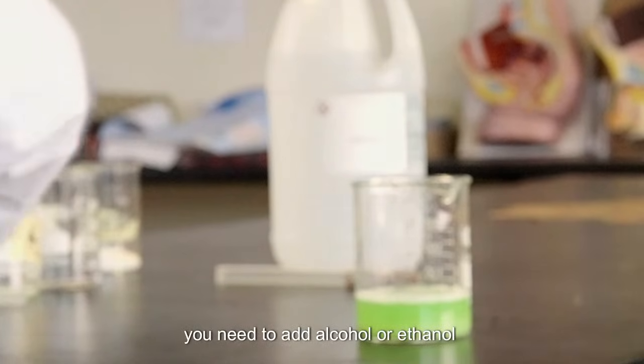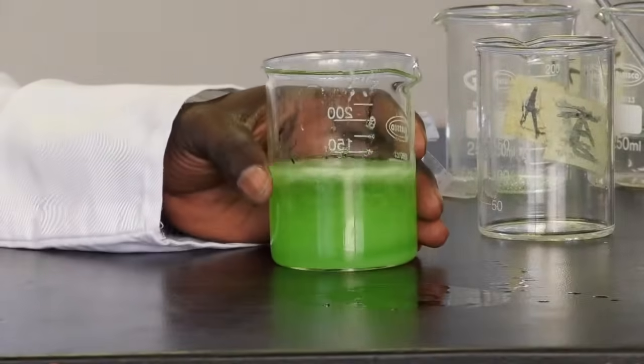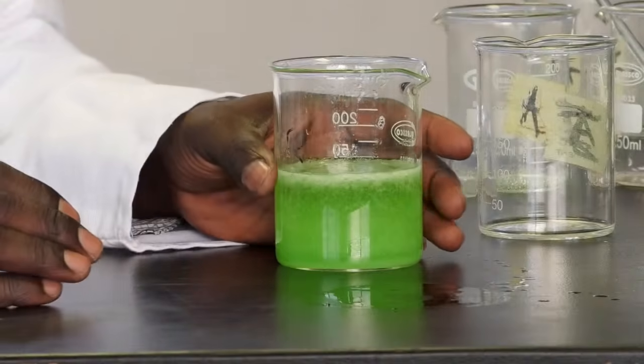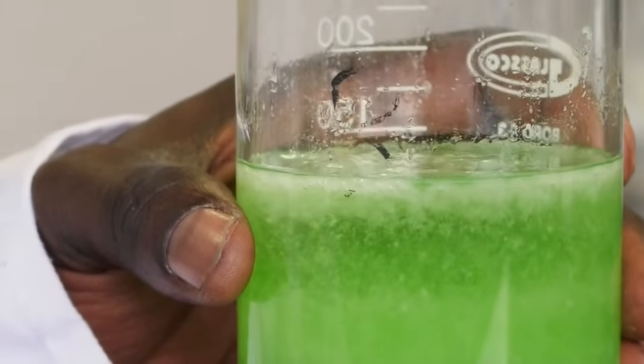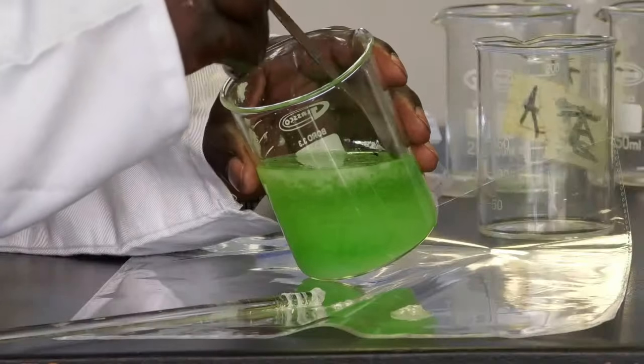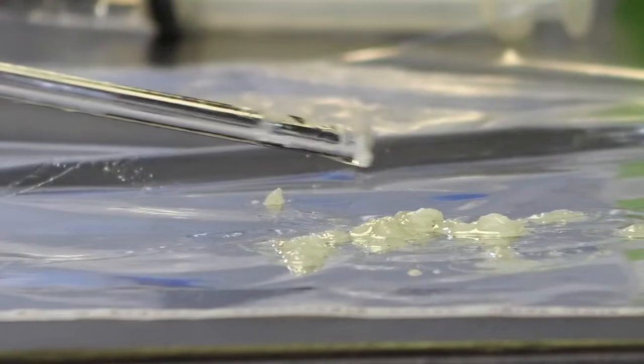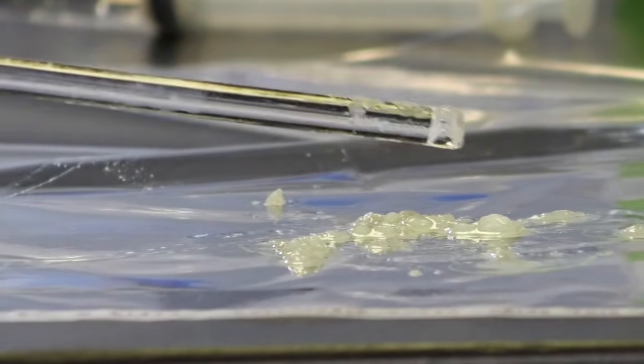Now we need to add the alcohol or the ethanol in here. And then we can wait a bit as it precipitates. So basically that is DNA. For the extraction, scoop it out with a spoon, and when you view it under a microscope, you'll see entangled structures.